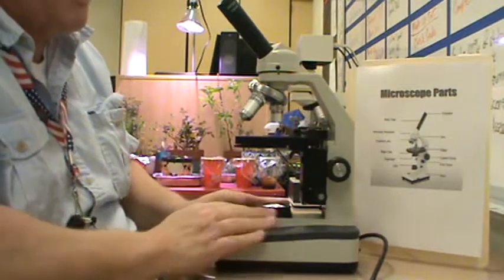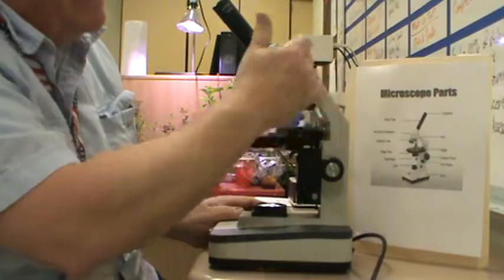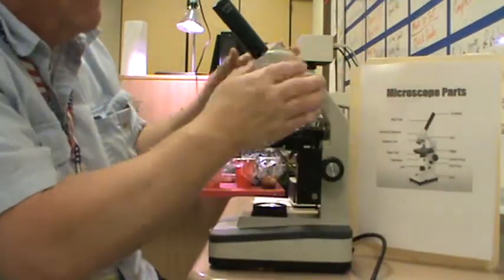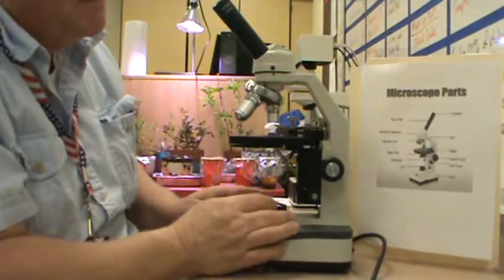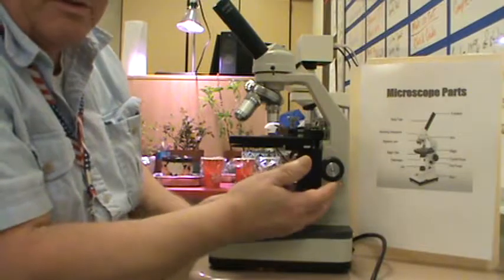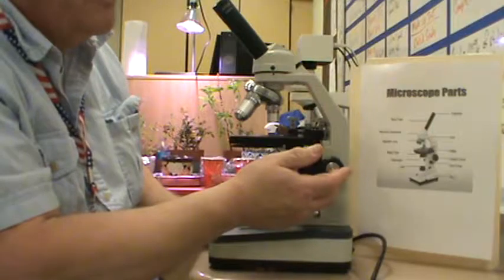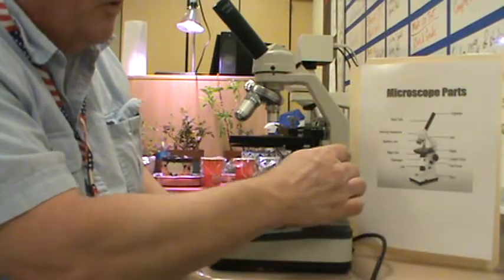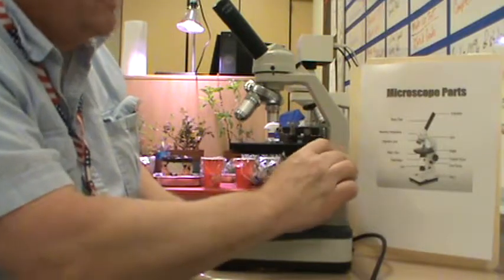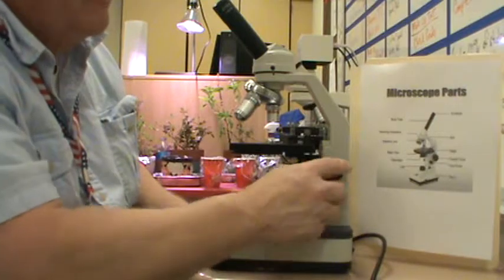The entire microscope is on a base. The back side is the arm, because it kind of reaches out here and holds the revolving nose piece. And then the business end here, besides the part that you can use to focus in on what you're seeing, we have the 2 knobs. The large one is usually called the coarse adjustment or the coarse focus. The small one is the fine adjustment or the fine focus.